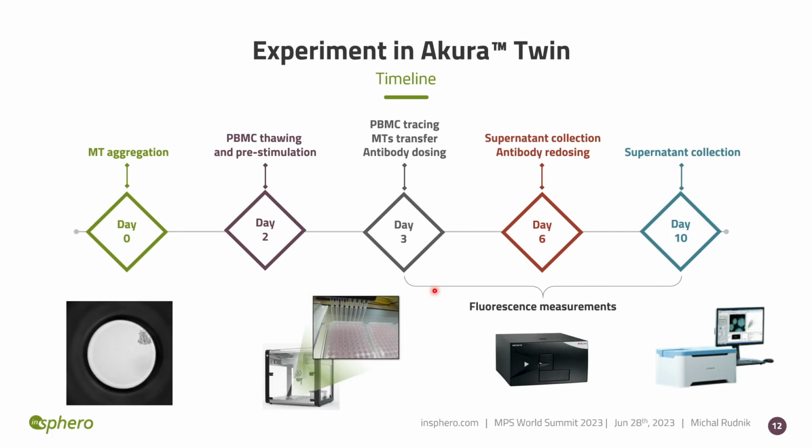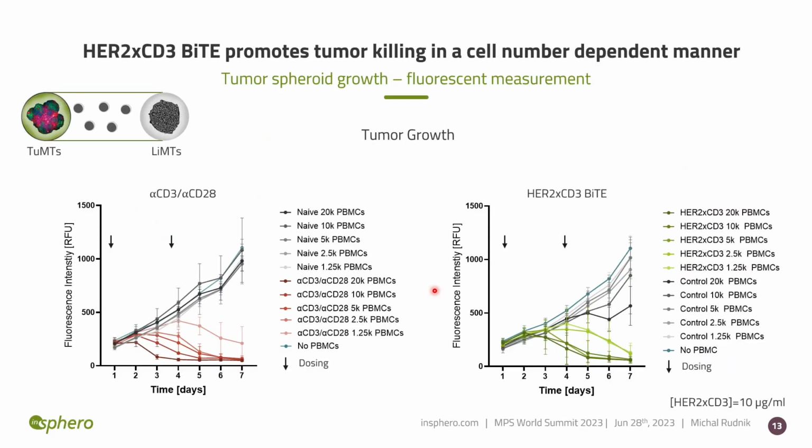Then the spheroid can be transferred to the twin plate manually or in a semi or fully automated way by a robot. At last, PBMCs are applied and the compartments dosed, and experiments run up to 7 days, with monitoring of tumor growth, measured as fluorescence of labeled cells, and the liver condition evaluated by the release of liver aminotransferase ALT, a common clinical biomarker.